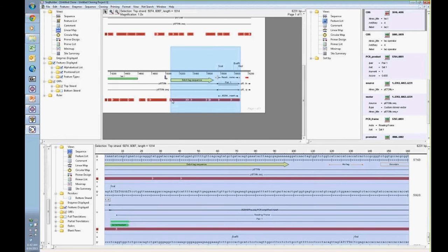Why would I want to look at the translation of this? So when you're trying to purify this, maybe it's in the insoluble fraction. With this strategy, using this DSBA tag, there's a high likelihood that since it's being forced to the periplasmic space, it will be in the soluble fraction, but maybe it's in the insoluble fraction. A couple things based on your primers that you've designed: maybe that binding site of your target is embedded in the actual, when you have the DSBA tag added to the 5' end of your target, maybe the actual primer site may be embedded within the protein. So these are all things to think about when you're doing your analyses and you're using your target-specific primers, that if they're not being recognized or not amplifying something, it could be simply embedded within that DSBA tag.